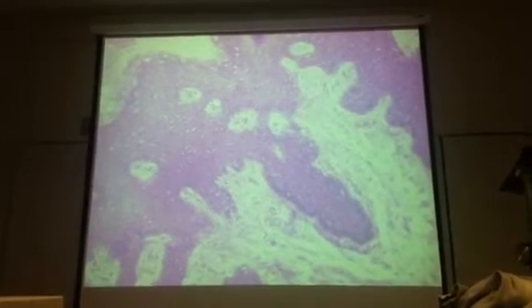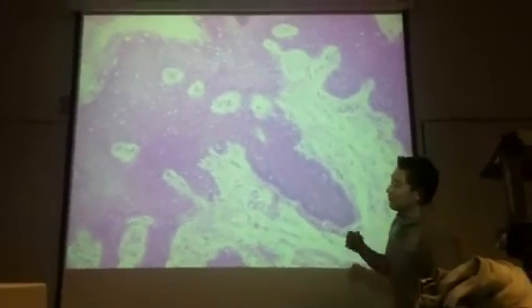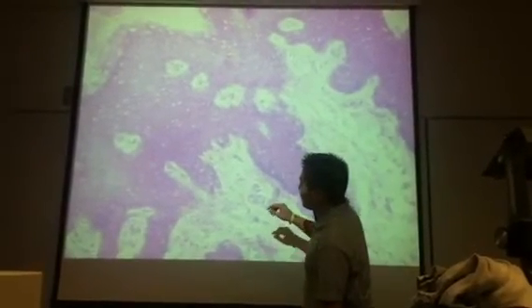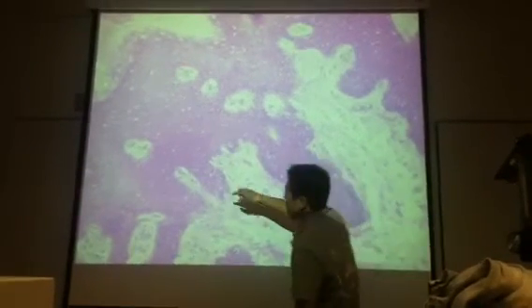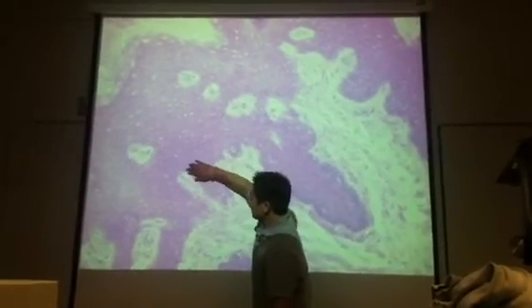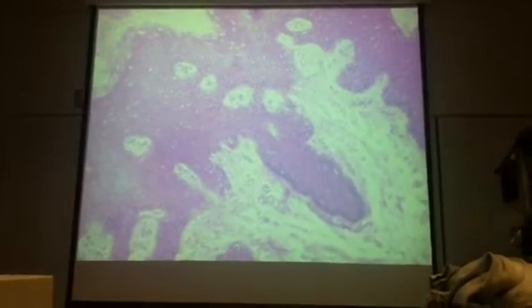How many people can point out a Meissner's corpuscle on this slide? So on this slide, they are very hard to find. The one thing to remember is where are the Meissner's corpuscles going to be located? They're in the dermal papillae, or they're going to be more superficial, towards the top of the skin. They are spherical-like structures — there's one right here, this structure right here.